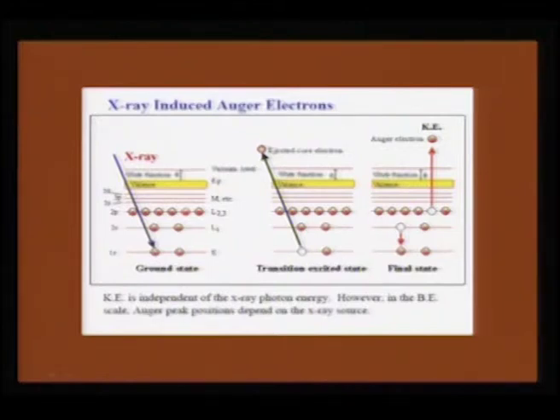So, when we have this X-ray photoelectron, the electron is ejected from the core shell, and this is the core shell electron which has gone. That means the binding energy is the energy that we go from here to the valence band and from the valence band to the vacuum level. That is the energy associated with the kinetic energy of the ejected electron.